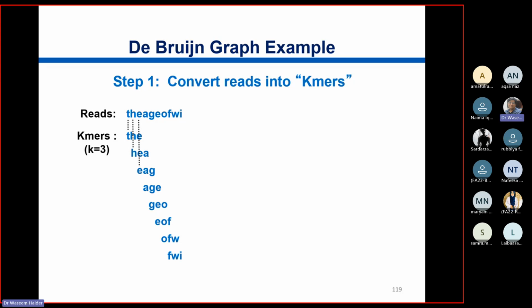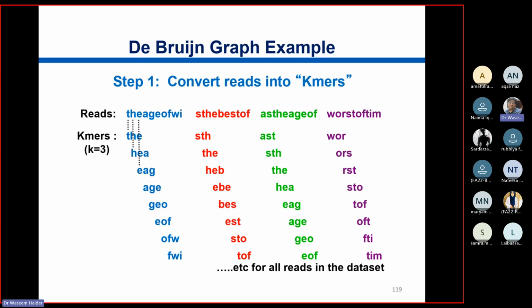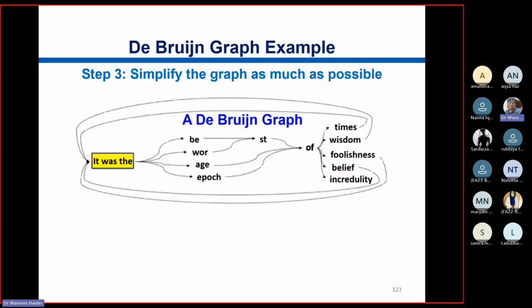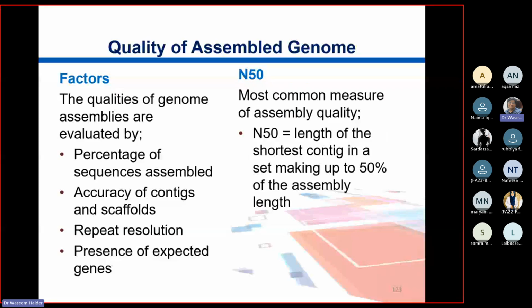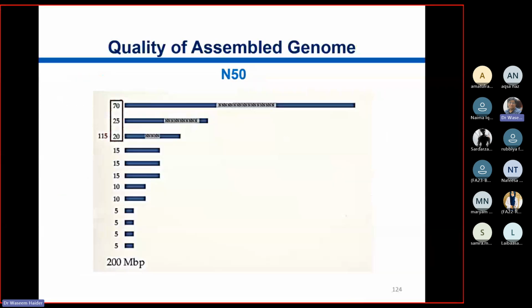I guess 8 or 9 of them, 8 of them probably. How many? 1, 2, 3, 4, 5, 6, 7, and 8. Obviously, you cannot go beyond this, so you just leave the last two characters. So total here there were 10 of them, so we can make 8 k-mers of size equal to 3, right? And the same for the next read fragment and the next and this one. With the help of that, tools like Velvet solve this assembly problem real quick, right?